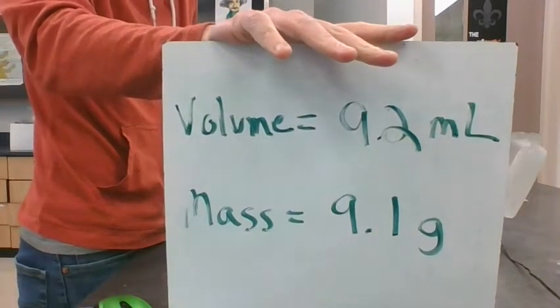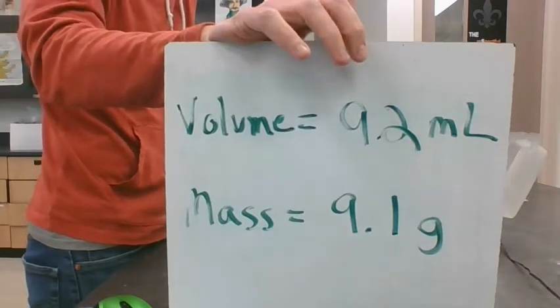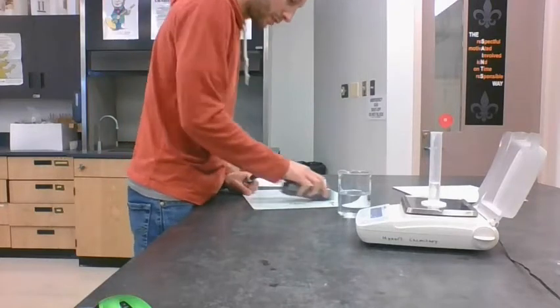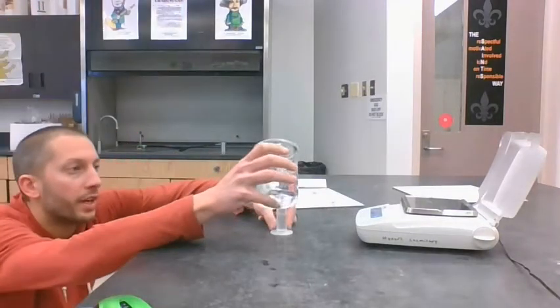So 9.2 milliliters, 9.1 grams. That's our third set, and then we need to do one more. A little bit more, and see what happens from there.